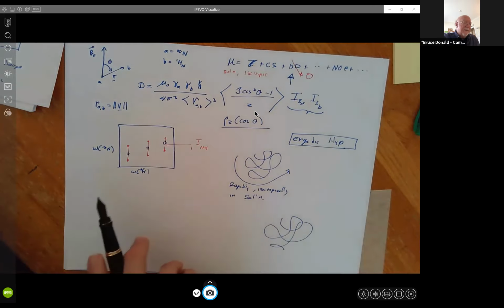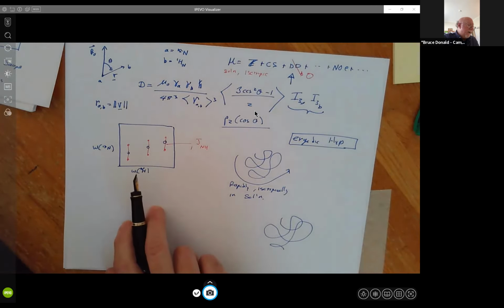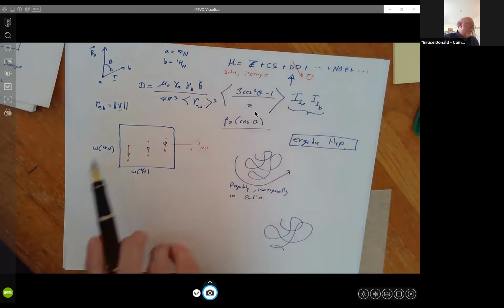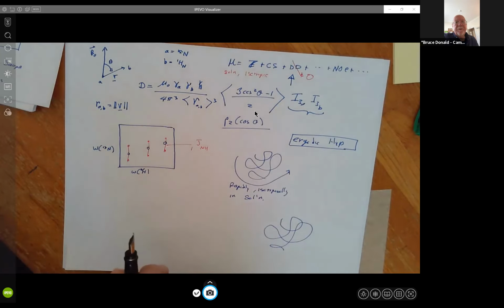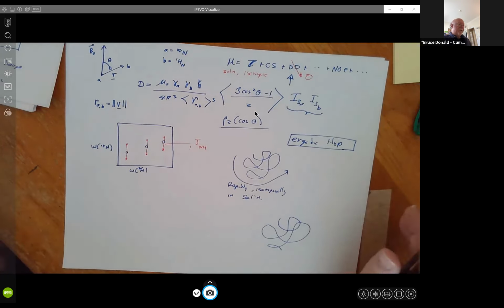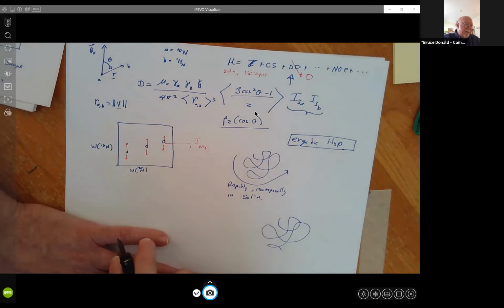Well, in solid state NMR, where everything is aligned, everything's basically a crystal, these are not zero because everything is aligned. And in fact, they're enormous. To give you an idea, they can be like 20 or 30,000 hertz, whereas the chemical shift part is maybe 200, 300, 400 hertz. So they're actually the largest dominant thing, and they're actually not used directly in solid state NMR anymore because they're so huge. If you just aligned everything, you'd see the signal, but it would swamp everything else and be enormous, and you can't resolve it.